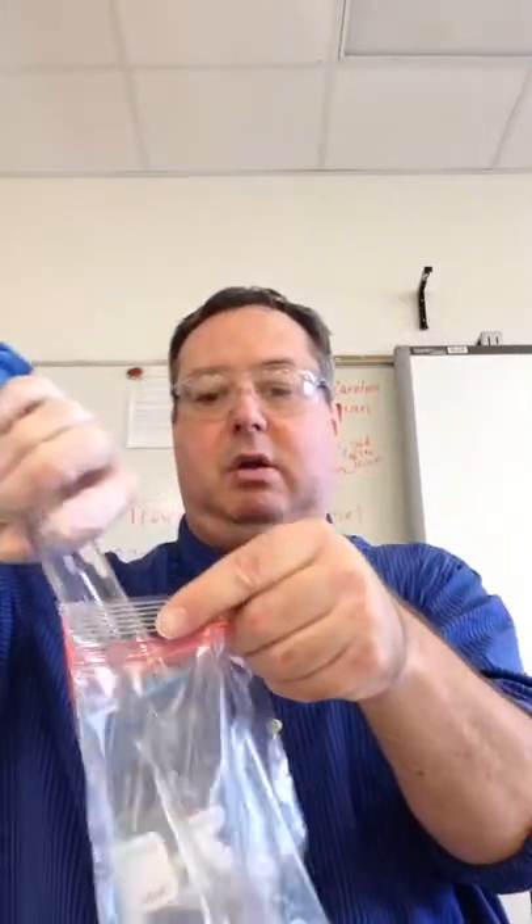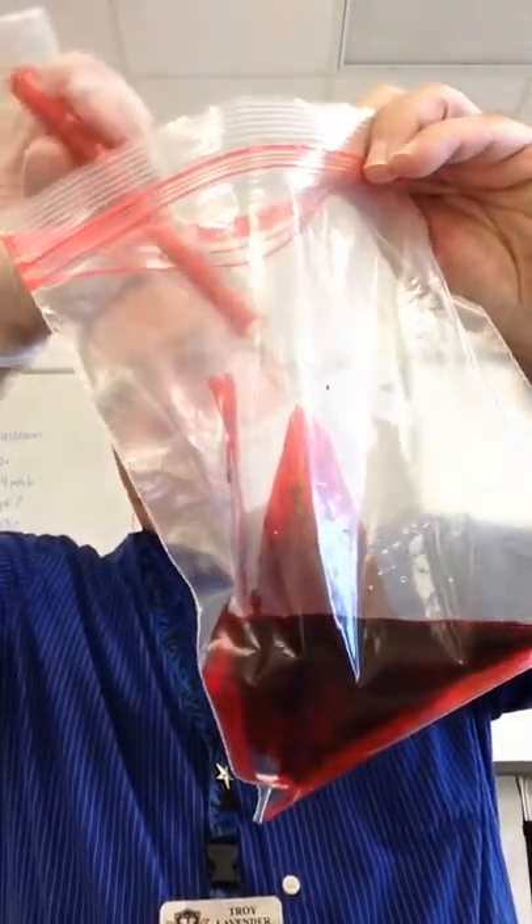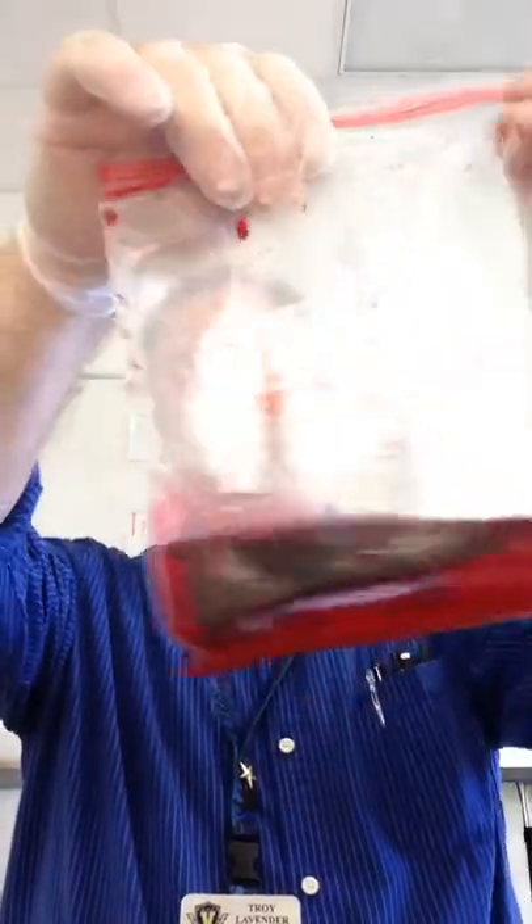The first step is to pour 100 milliliters of water into your ziplock bag. I've got my bag here and 100 milliliters of water, so I've got it in there. The second thing you're going to do is add 5 milliliters of phenyl red to the bag. Seal the bag, gently slosh the bag back and forth, and record any observations. Fill out the row for change number one. I'm adding the phenyl red, closing the bag, and sloshing it. Record the observations of what you see.